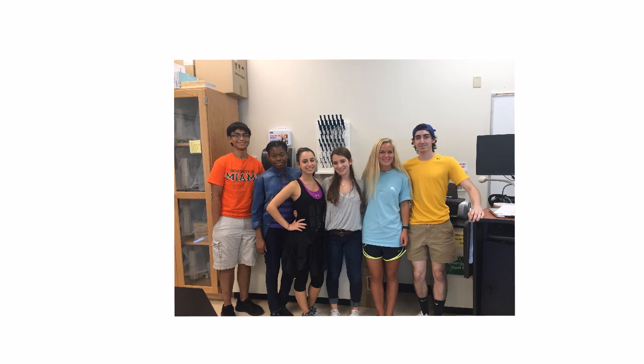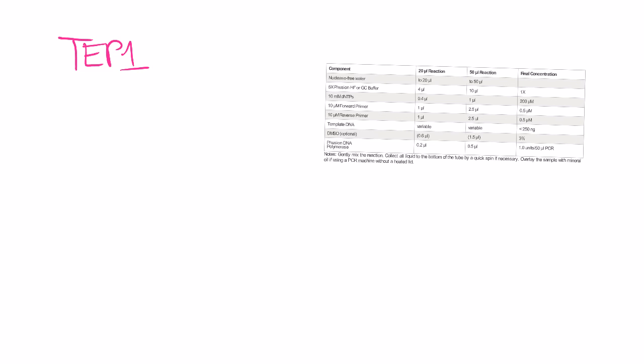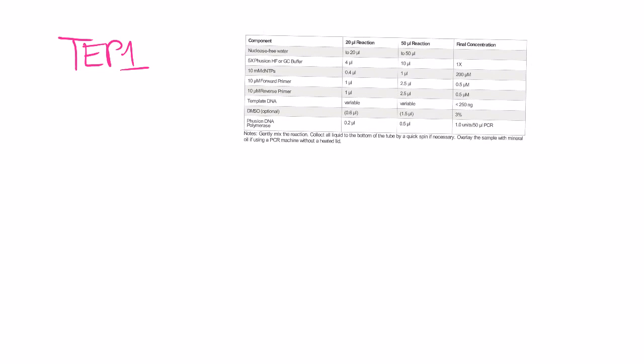This is us, our lab group. Our goal was to use PCR to amplify the TEP1 gene. The TEP1 gene would later be transformed with budding yeast, but for now, let's focus on how we did this with TEP1. This was our list of materials.